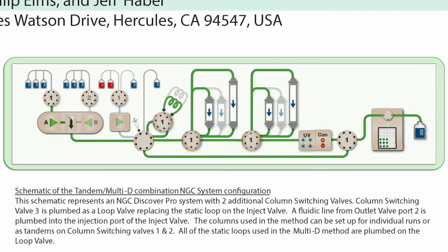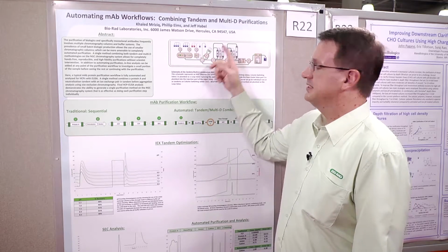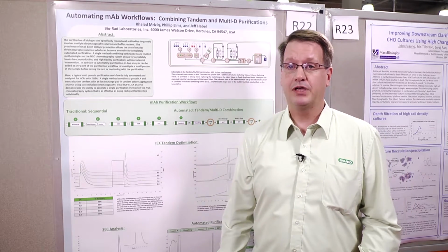Again, we're combining tandem, so two columns in line together, with a multi-D solution. So when the antibody of interest is eluted, it's going to come back and be put into our loop for storage, and then loaded onto the next tandem for continuous purification.